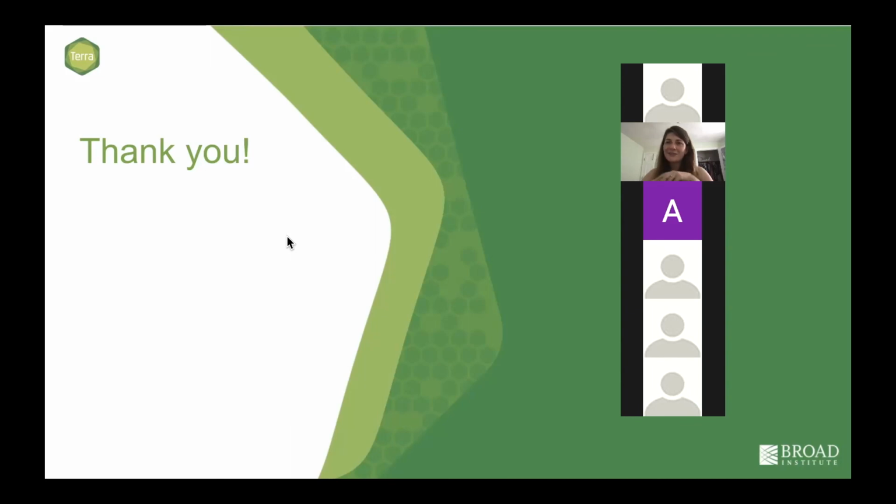Any other questions related to Terra or the cloud or single cell portal? There's one in the chat. Oh, there is. Thank you.